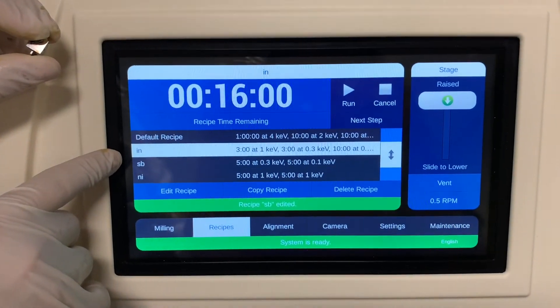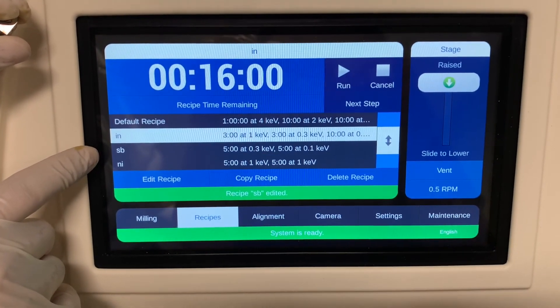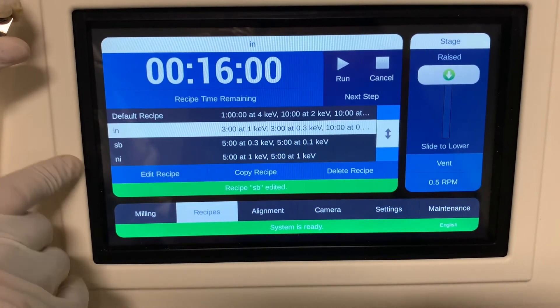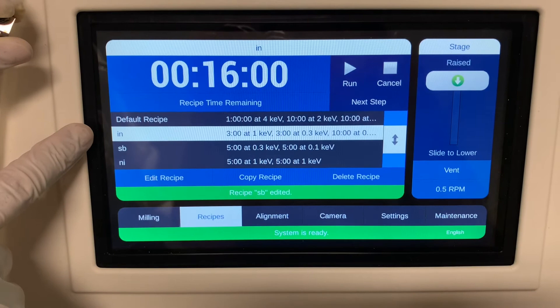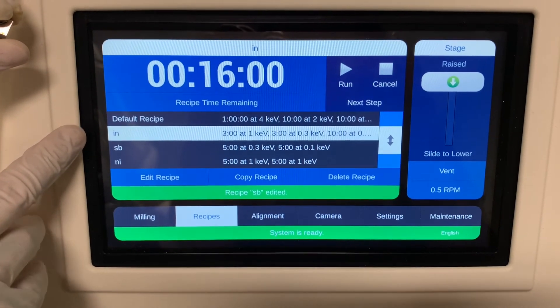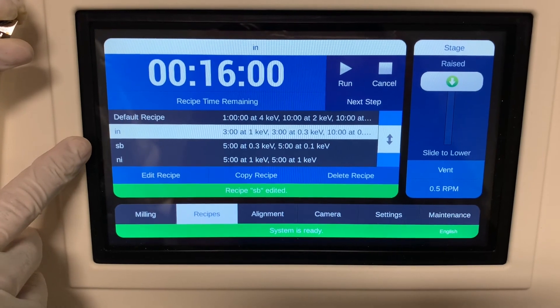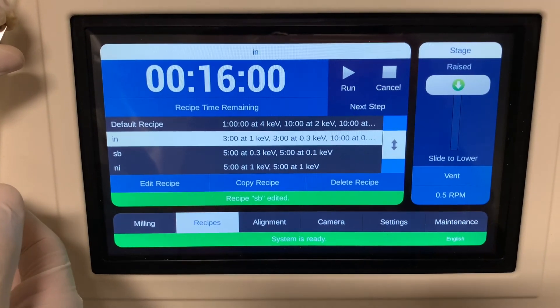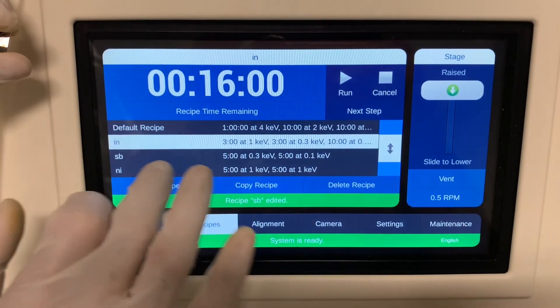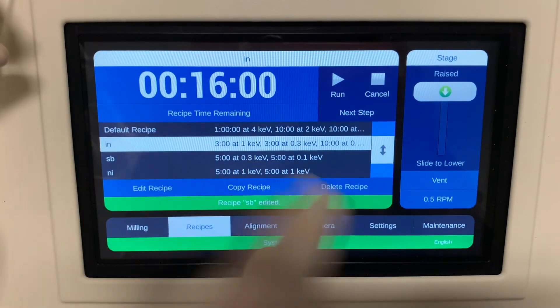Here I have three recipes: indium, antimony, and nickel. The indium sample should be done under minus 50 Celsius, and the antimony and nickel samples can be done under ambient temperature. Choose the right recipe and start it — that's it.